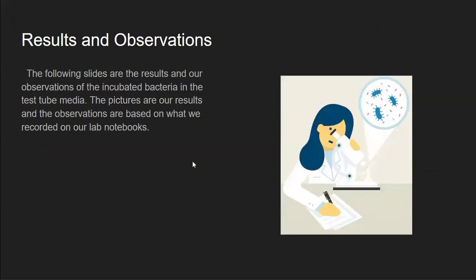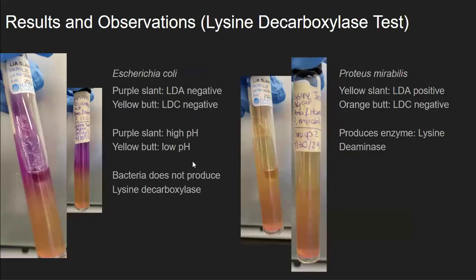The results and observations. The following slides are the results and our observations of the incubated bacteria in the test tube. The pictures are our results, and the observations are based on what we recorded in our lab notebooks. Results and observations, lysine decarboxylase test.